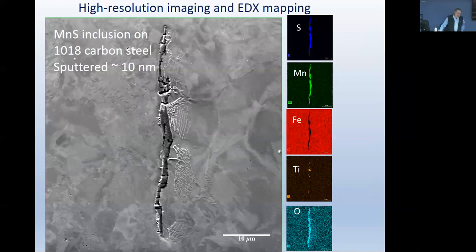Okay, so if these materials of interest, elements of interest are localized, not a solution in a solid, yes, we can do a very good job by mapping it first and then attacking it that way. But if it is a solution of one element into another element, then we are talking about maybe a couple percent at the best. Sure. I hope I answered. Yeah, that's very helpful. Thank you.